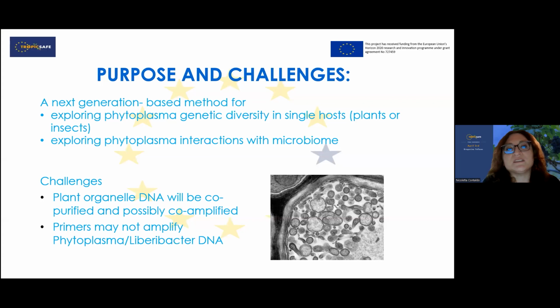The purpose of this study was to explore a next generation based method for the phytoplasma genetic diversity in a single host, either plants or insects, and to explore phytoplasma interaction with the microbiome. The main challenges of this study were to avoid the co-purification and possibly also the co-amplification of DNA of plant organelles, and to amplify selectively all bacteria, including phytoplasma.